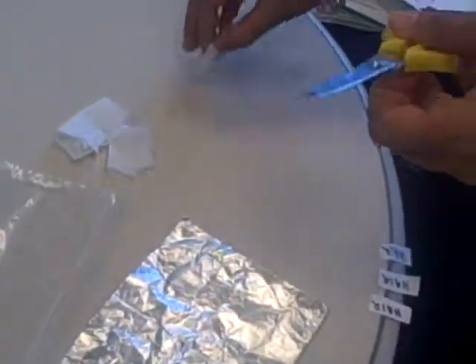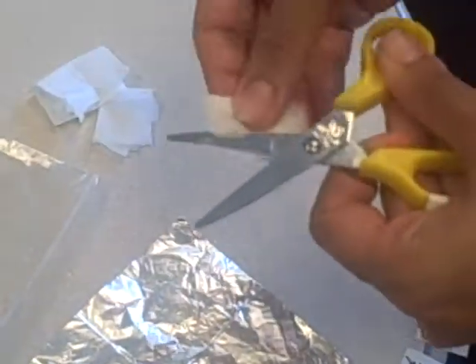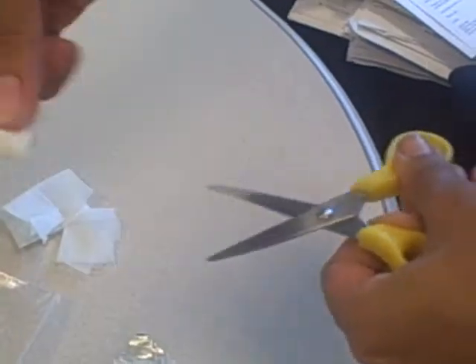I'm now going to demonstrate the collection of the hair. First I will wipe off the blades of the scissors using an alcohol swab, and I'll do this between patients.